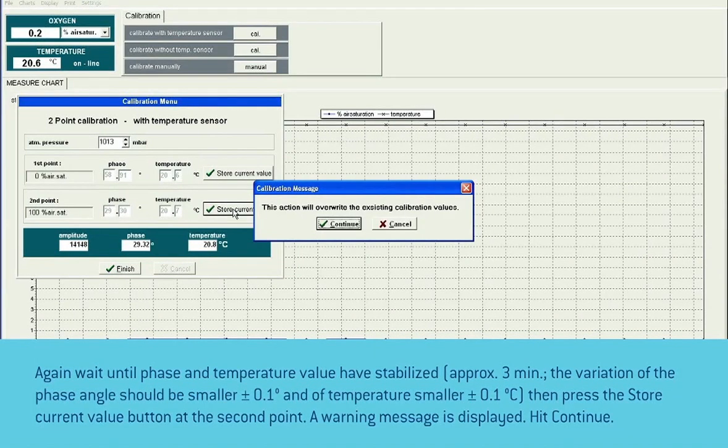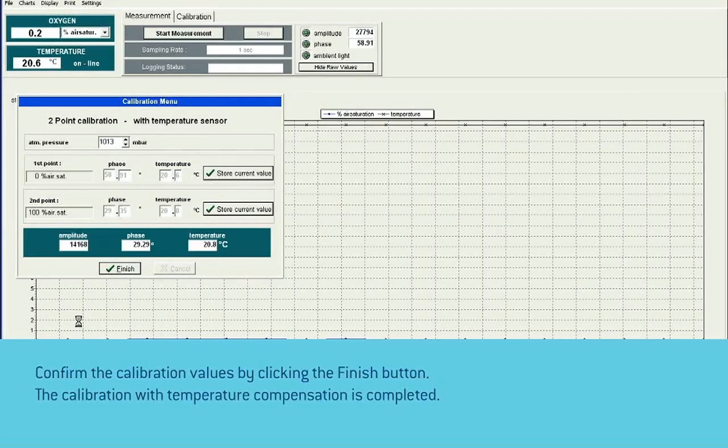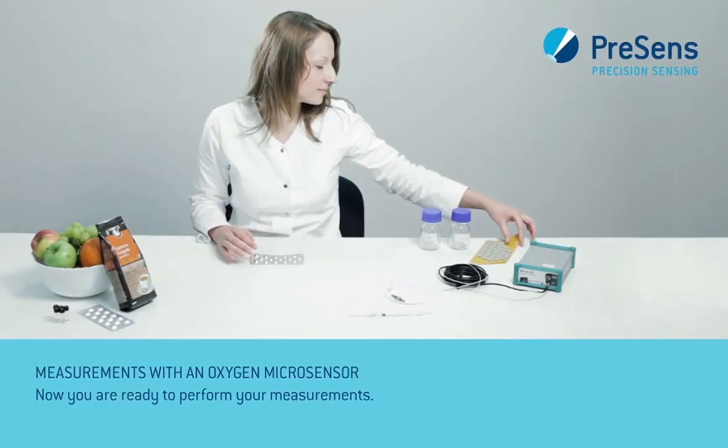A warning message is displayed — hit continue. Confirm the calibration values by clicking the finish button. The calibration with temperature compensation is completed. Now you are ready to perform your measurements.